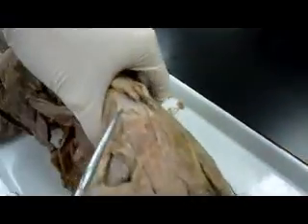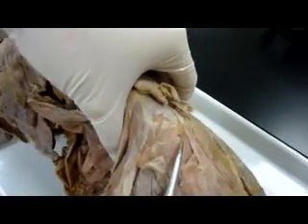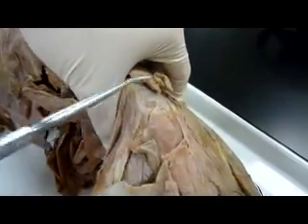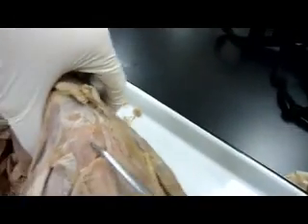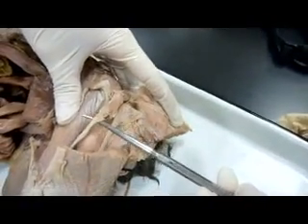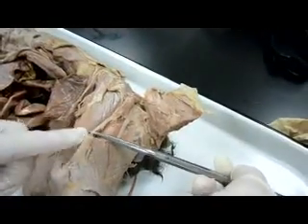This here is gluteus medius. Gluteus maximus comes up over the gluteus medius. And then the caudofemoralis ends in the long tendon running down.